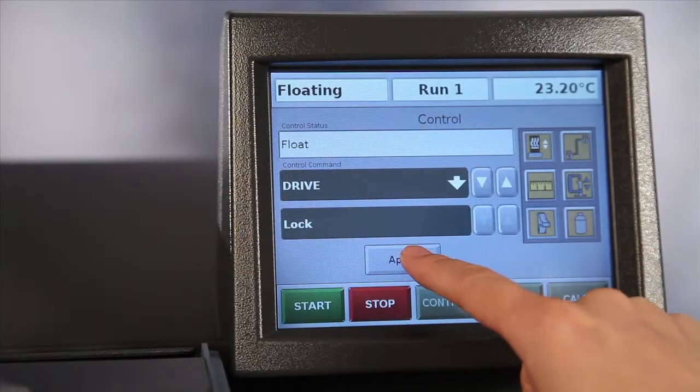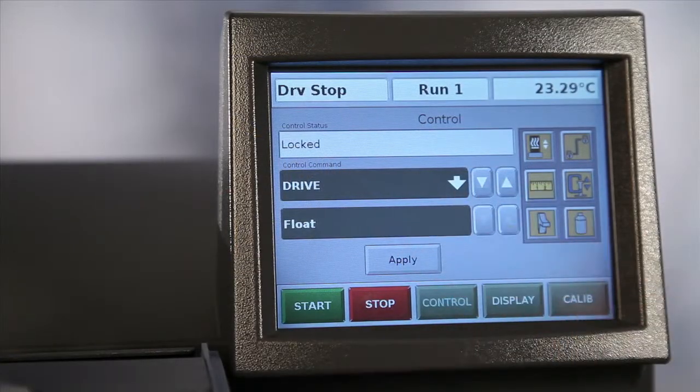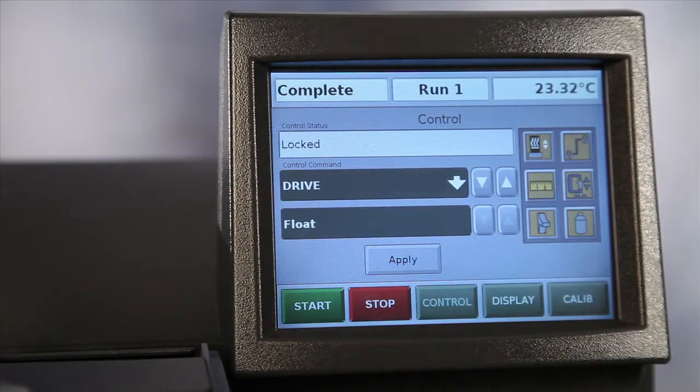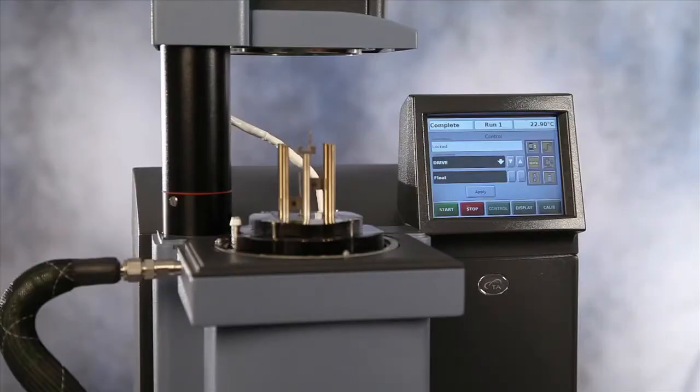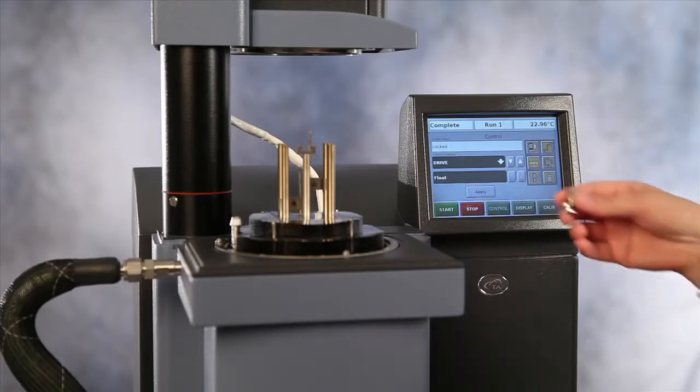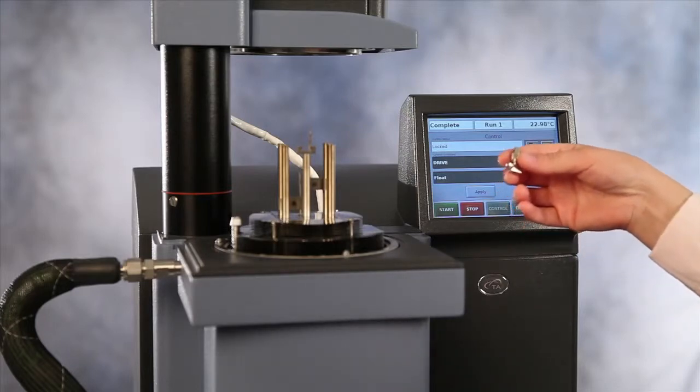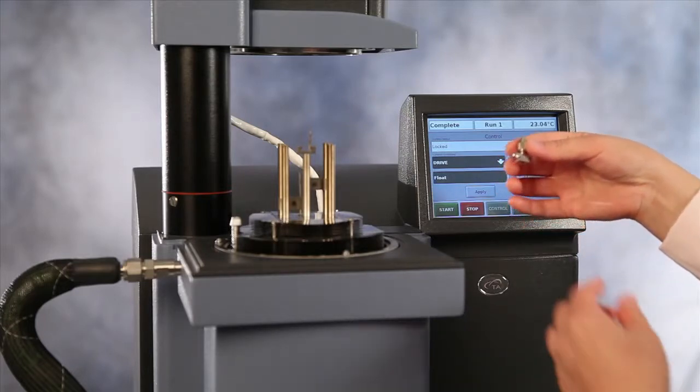Lock the drive shaft from the touchscreen. Install the movable clamp to the drive shaft.